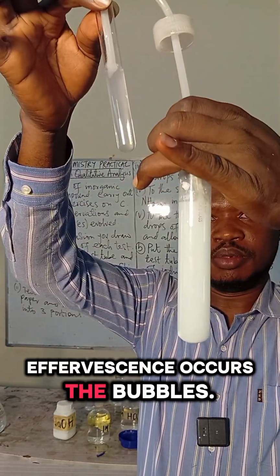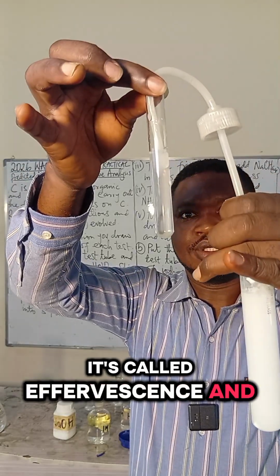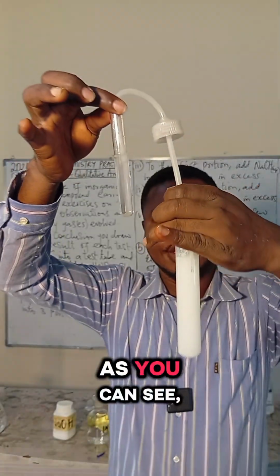Effervescence occurs, the bubbles, called effervescence, and it turns the lime water cloudy, milky, as you can see here.